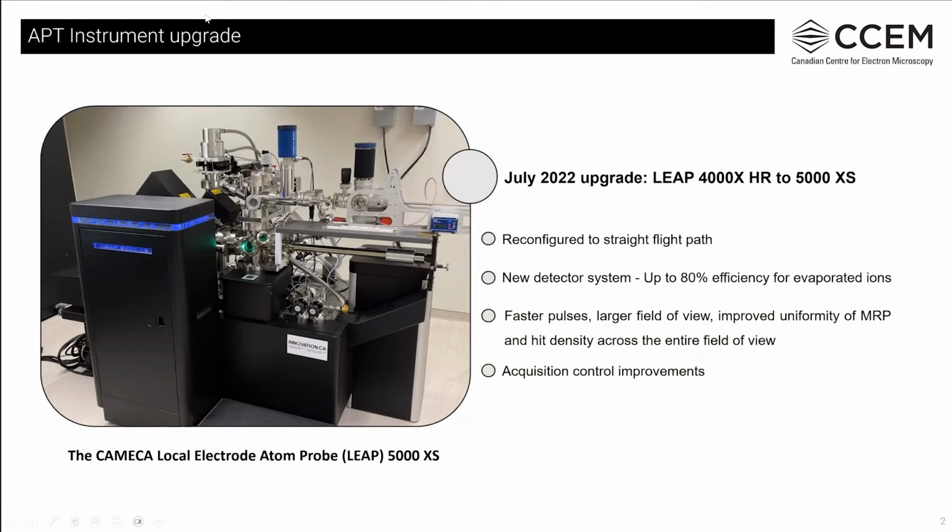There are also some major changes to the acquisition controls and software, and in the following slides, I would like to go over some of these features in detail.